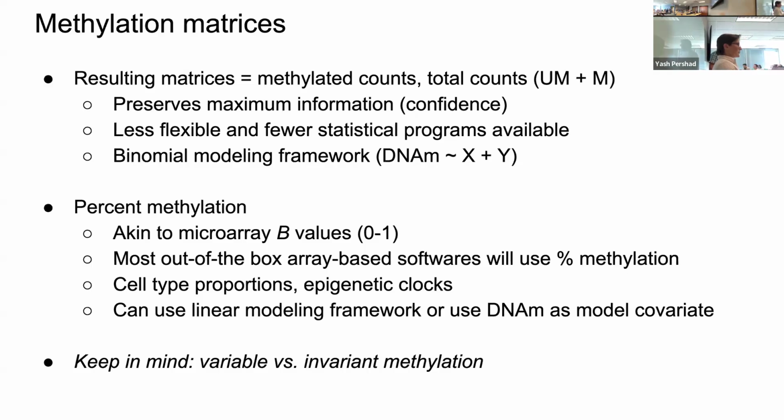For example, we're making epigenetic clocks in our lab, and you can do that with all of the CpG sites, or you could limit it to ones that are really, really high coverage. There's reasons where you might want to do one or the other. But this is, I think, really important information that you do get from sequencing-based technologies, which is that read depth.